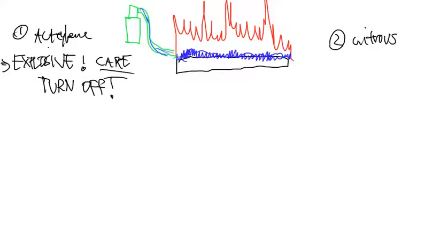So if you do not turn this tank off, if there is a leak in the line, then you're going to get acetylene that begins to fill up the room. And any little spark that you're going to have will cause this to go boom! And you don't want that to happen, right? So when you're not using the AA instrument, turn off the acetylene tank. Don't be blowing up our lab, and you'll be okay.